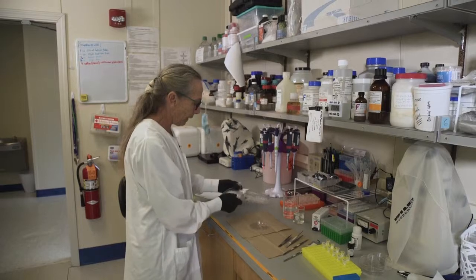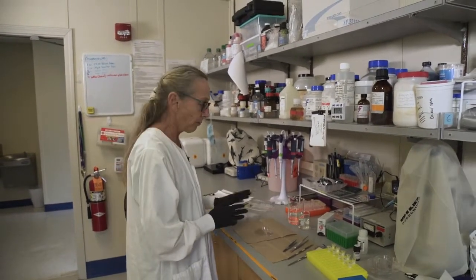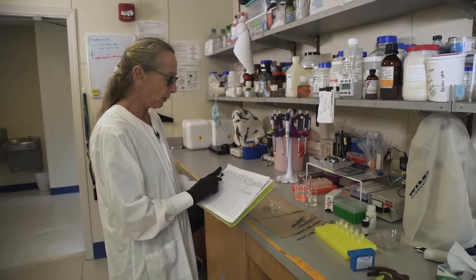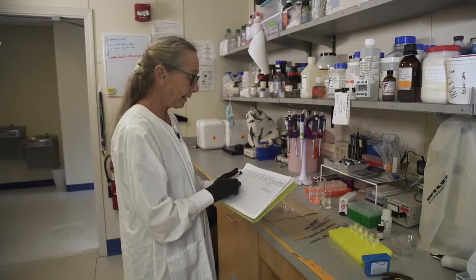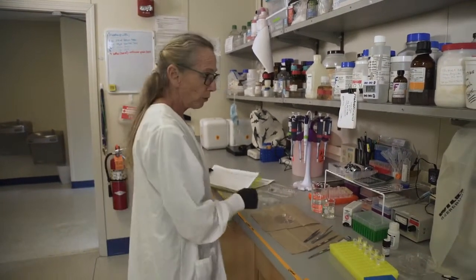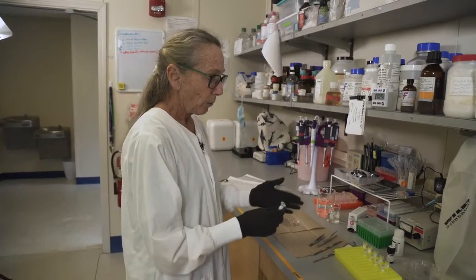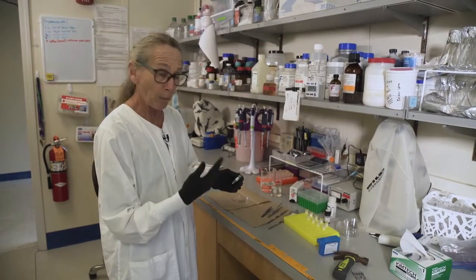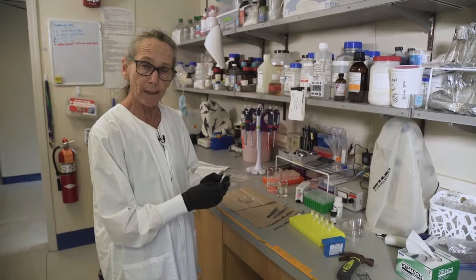I have here a couple of samples — a slug and a snail. The process is a little different for both, and they've been in the freezer so we're ready to process them. When we bring a slug or snail in for tissue processing, we enter that animal into our RLW log, recording the date the sample was collected and the date we're going to process the tissue. The first step is weighing our tubes, which are labeled with an identification number and the species name abbreviation. We weigh the tube so we can know the weight of the tissue we take.